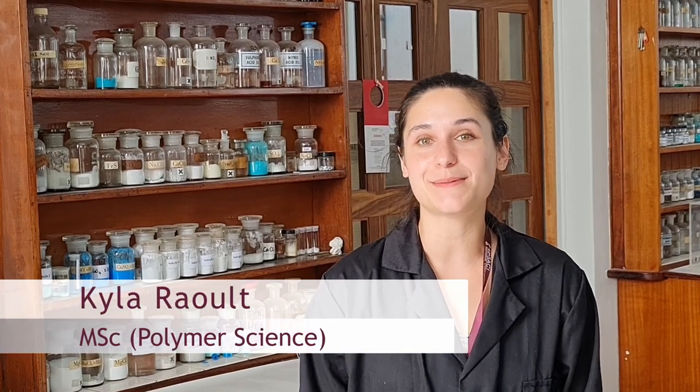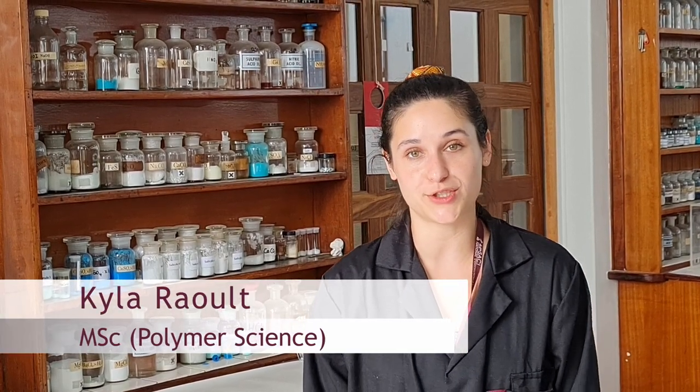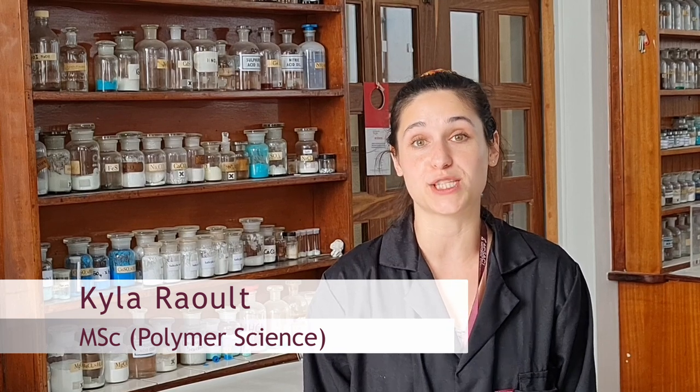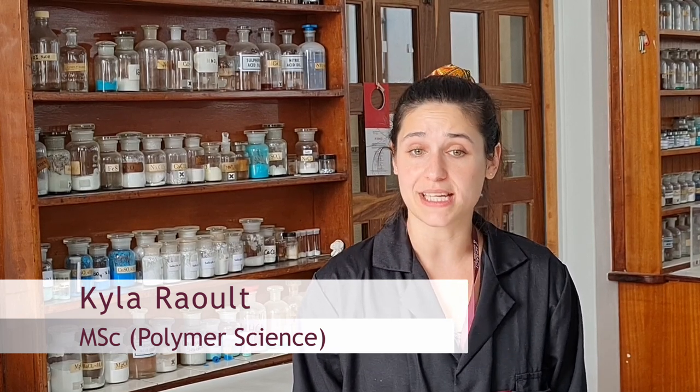Hi everyone and welcome to the Chemistry 124 demonstration video on how to use a burette. Your burette readings are taken in cubic centimeters and the volume that is delivered on the graduation line is delivered accurately, so don't forget to report all of your recordings to two decimal places.